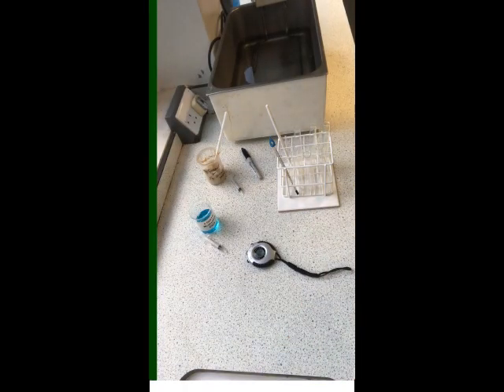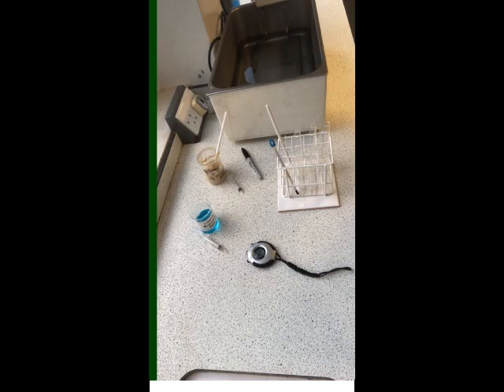Okay, so what we're going to do now is have a little run through a practical, a required practical, which is the effect of temperature on the rate of respiration in yeast. So, when yeast is carrying out respiration, as we hopefully already know, there is a lot of electron movement. We've talked about oxidation being loss of electrons and reduction being gain of electrons. Now, this movement of electrons, these redox reactions, we can use them to try and measure the rate of respiration.